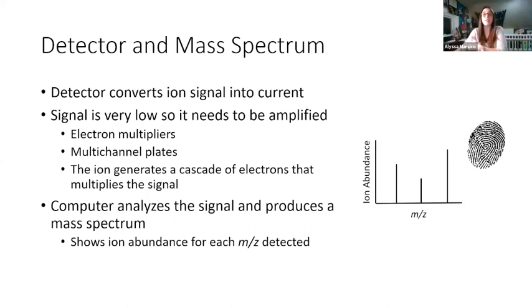And again, that produces a chemical fingerprint, because nothing is going to break like cocaine does, because cocaine has its own unique specific structure to it. Even if you have a chemical sample that has the same elemental composition as cocaine, the connections are different. When it breaks apart, it will produce a unique mass spectrum.